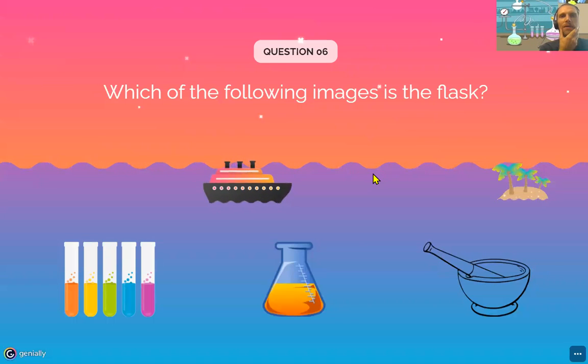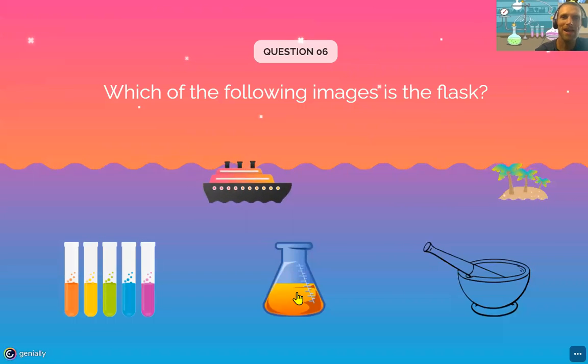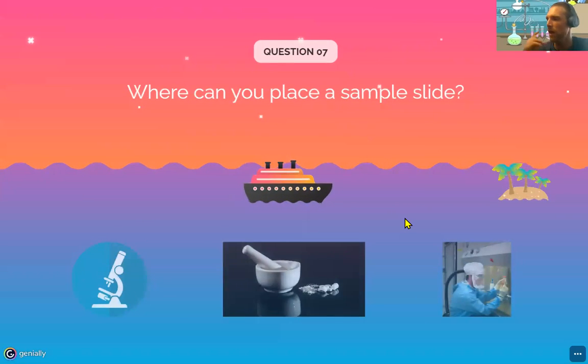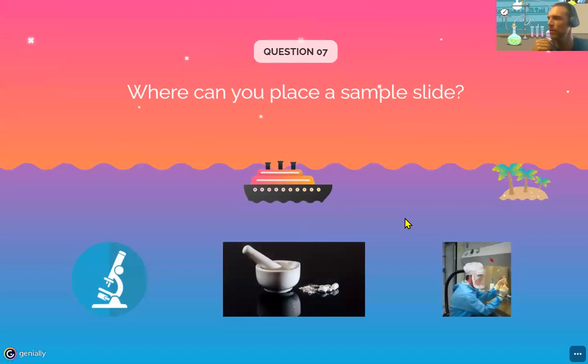I think it's also an easy one. The one in the center. Yeah, exactly. That's a flask. This flask, we also call them Erlenmeyer, this is the guy who started to make them. They have the advantage that they have a conic shape. It allows the flask to be stable. Also, the fact that the entrance and the exit is small reduces the risk of contaminating whatever you have inside. So it's definitely this one. Julieta, what do you think? Can you read and tell me what you think?